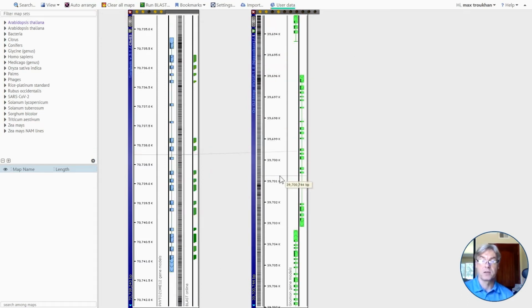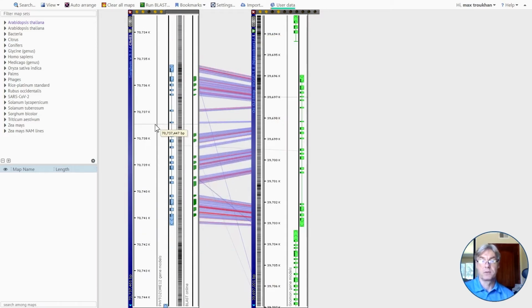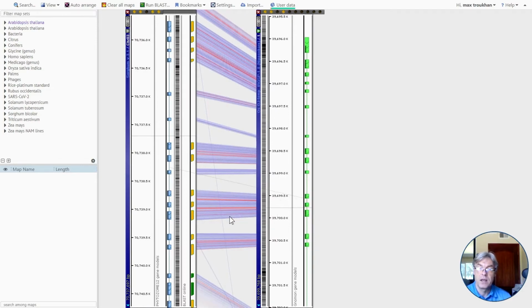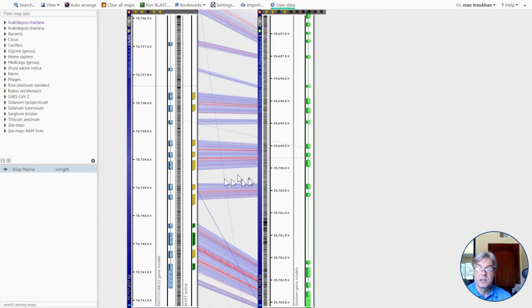You can keep studying this region. So we found that there is a protein hit, but we want to take a look at the DNA hit. So we compare this sequence on the right, we run instant BLASTn, and we compare it to the sequence on the left. So we display the result of BLASTn again graphically, and we have it with one nucleotide precision.